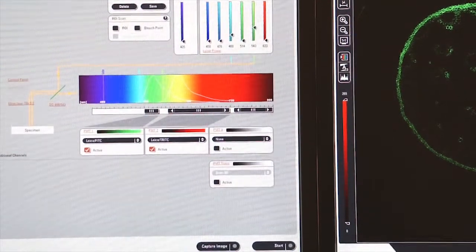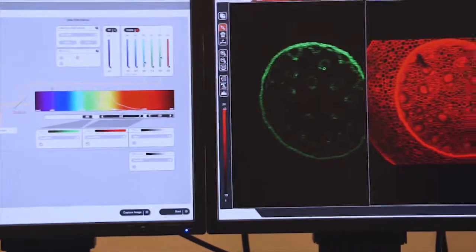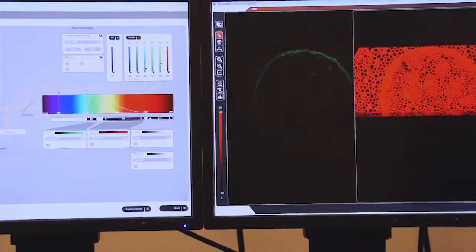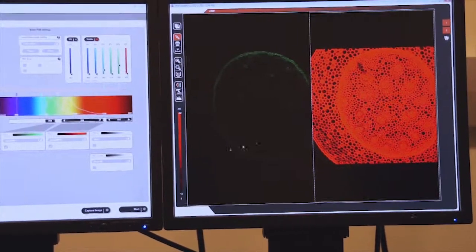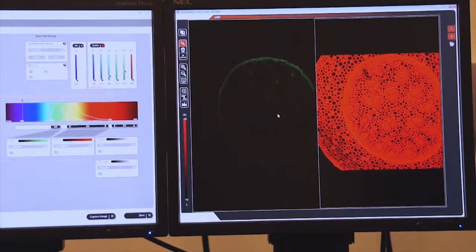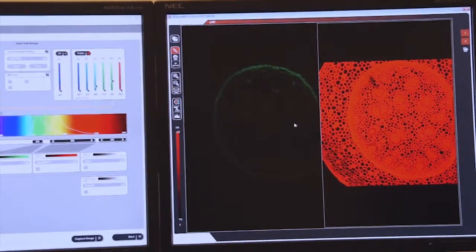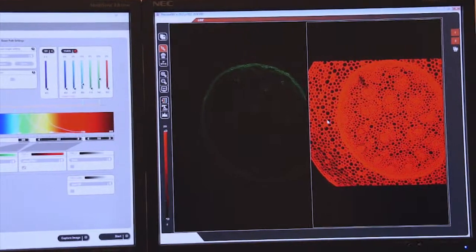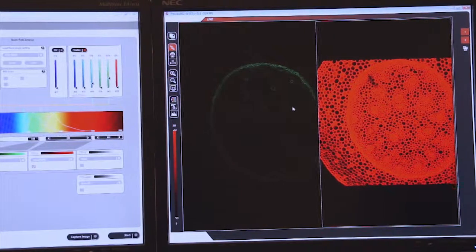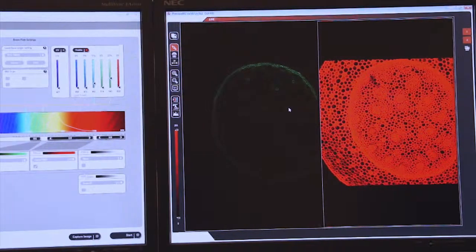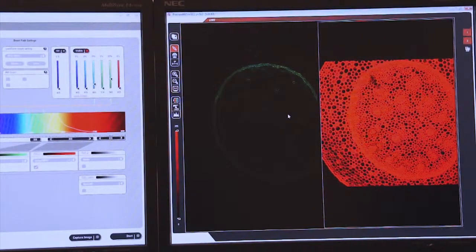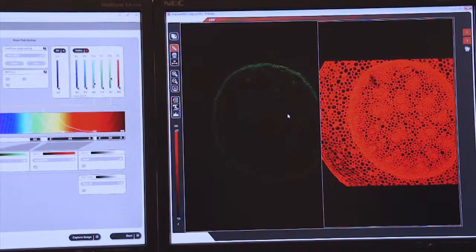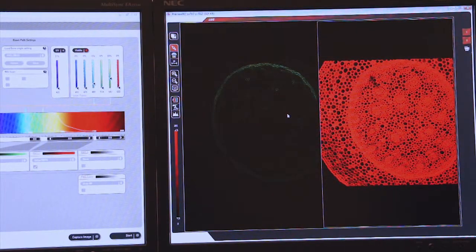If we go to live, we now see on the right screen the images of our corn in two different colors. We're exciting at two different wavelengths, and we're recording emission information also in two different wavelengths.